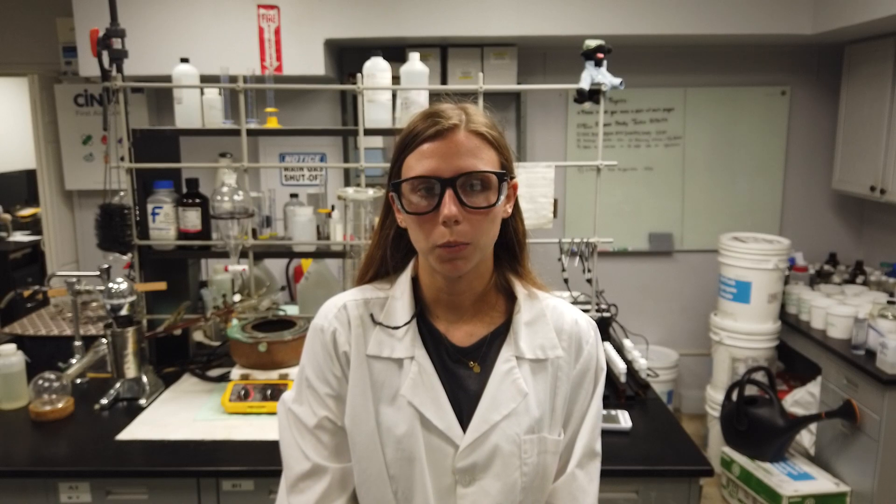This test kit is useful with our two-part PERQWA concentrate, Sterelex Ultra Disinfectant Cleaner Solution 1 and Sterelex Ultra Soft Metal Activator Solution 2.